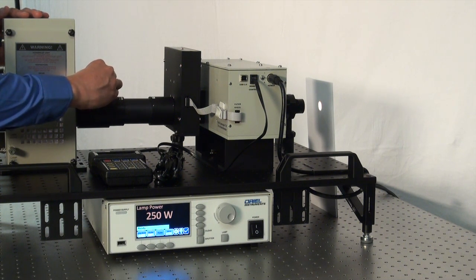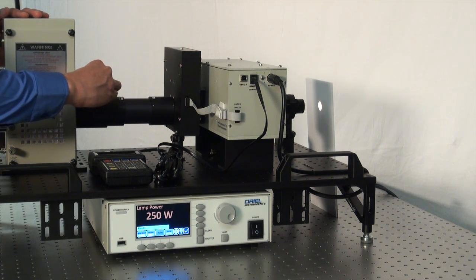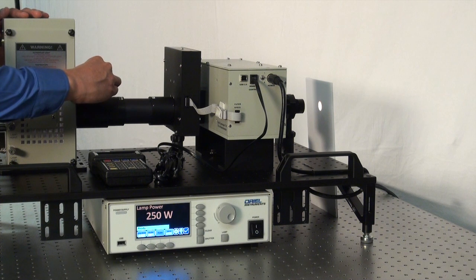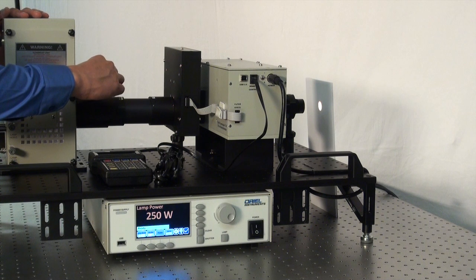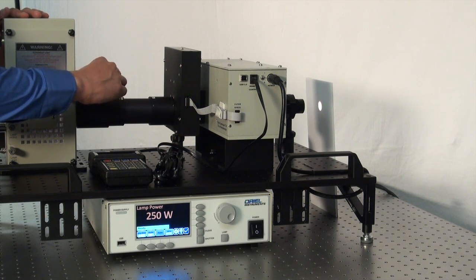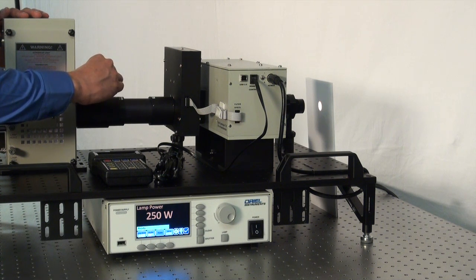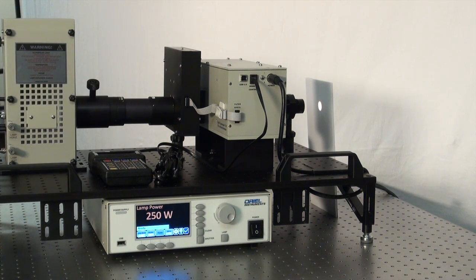This may take some adjusting as well, but adjust the lever until you get a uniform, perfect spot size on the output of your backdrop. And once you find that position, turn the knob to the right and fix the position of this focusing lens assembly. And you've just aligned your tunable light source.